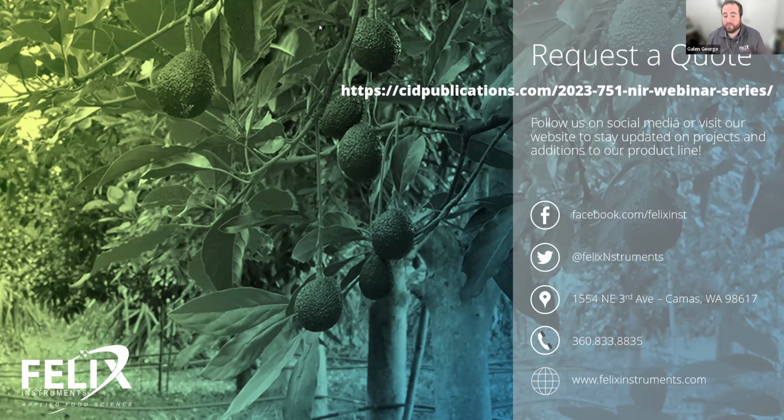You're going to need to perform that bias correction experiment, because there's always going to be some kind of small bias. As I mentioned, with our neural networks, there's always a small bias. Even when we calibrate them in-house, there's always going to be some slight variability between the fruit that we have available here in the United States versus the fruit that's available in Australia or New Zealand or South Africa. So what you need to do, and it's also in our user manual, is not a recommendation but a requirement of the actual technology.